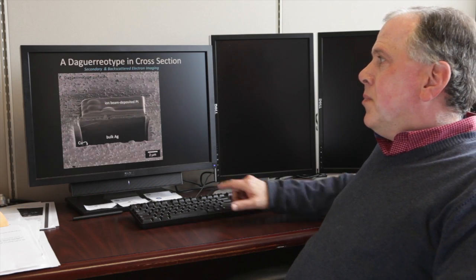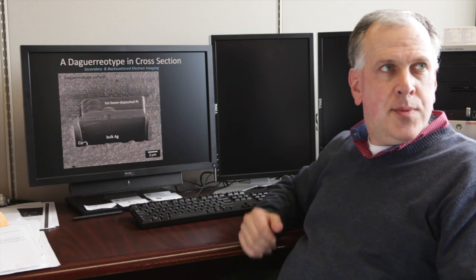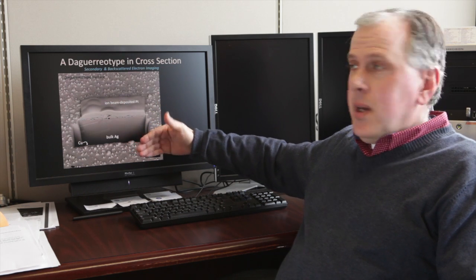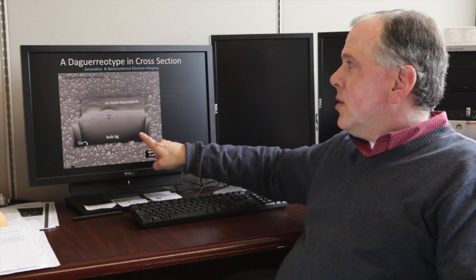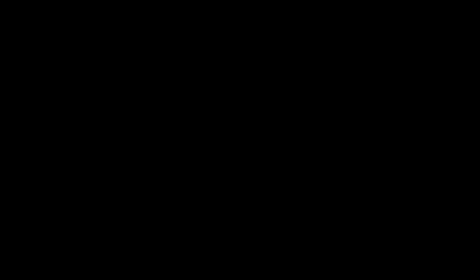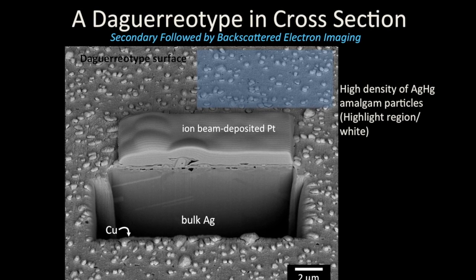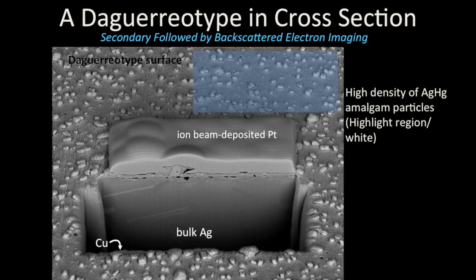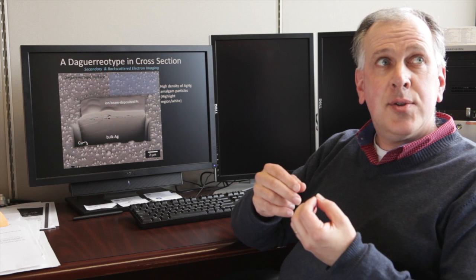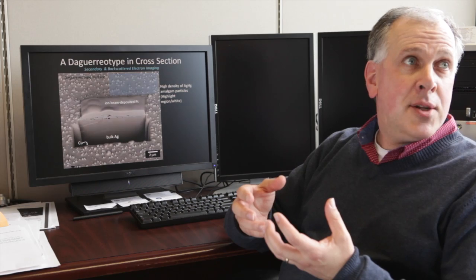If we were to look below the surface of the daguerreotype — here is the surface here — we've used an instrument called the focused ion beam to mill into the third dimension. We can see the silver below the surface and an outline in cross-section of those tiny nanoparticles we were just looking at. This gives us all kinds of information. We find little cavities below the surface, and that's giving us clues to actually how the image was developed by the daguerreotype process.